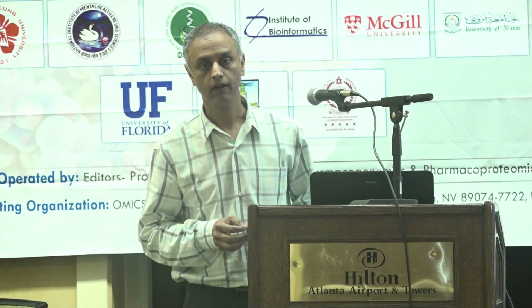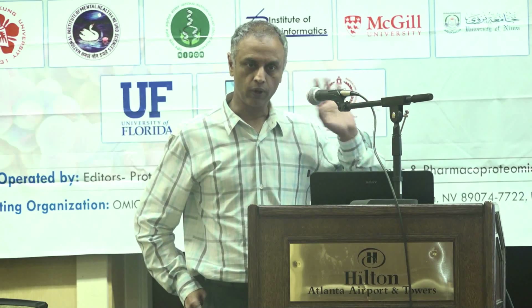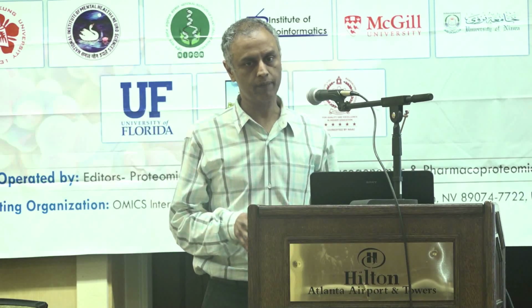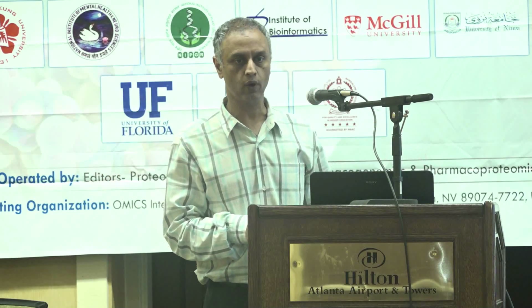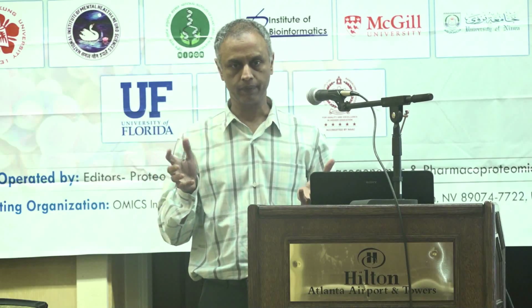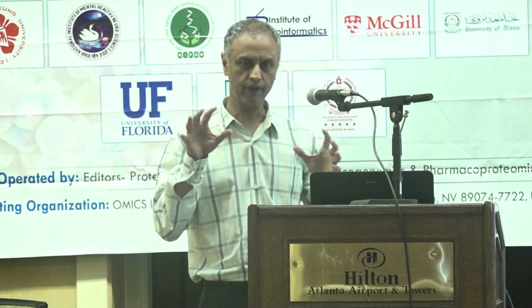Yes, so what I was talking about was what are the limitations of a MALDI-TOF mass spectrometry method, and the last point on that slide was that MALDI-TOF mass spectrometers are used in clinical microbiology today, but it is not for every organism, mainly because these companies that make the mass spectrometers take the organism, generate the profile, and put it in a database. If it is not in the database, then you cannot identify it, because it's based on a fingerprint, not sequencing of peptides.